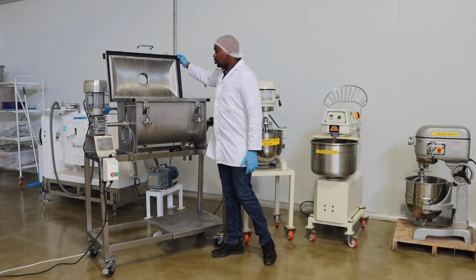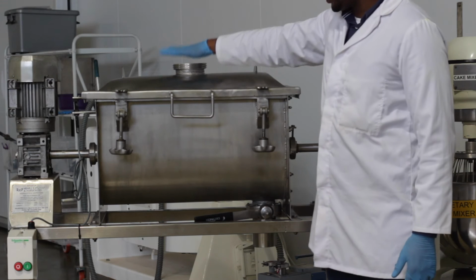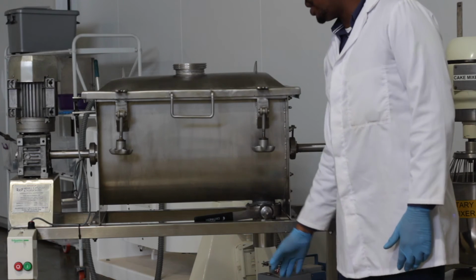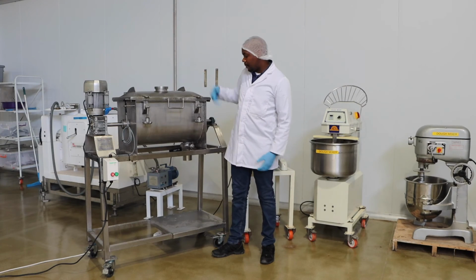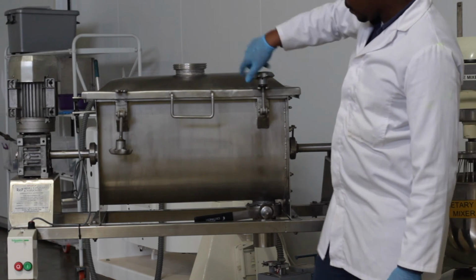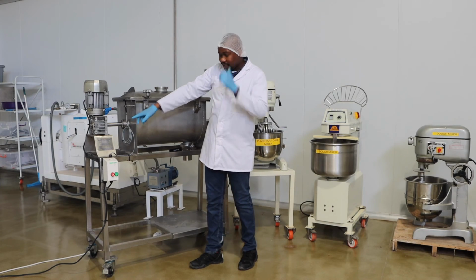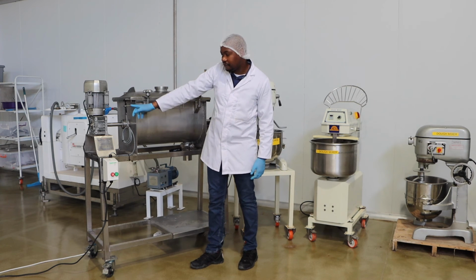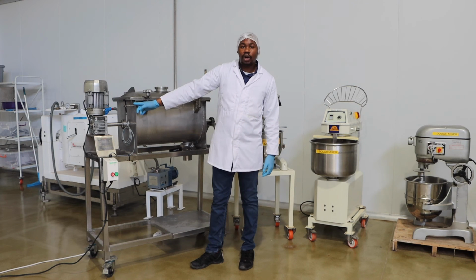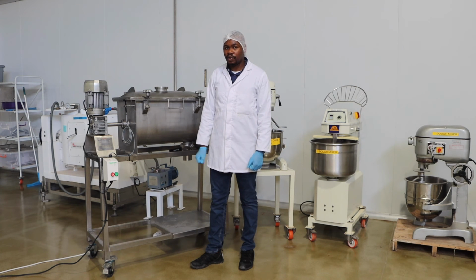The nice thing about this equipment is that it can open and close. So the product can come in here, or you can pre-fill it, and then here there is a valve that you can open when the product is done. So what basically happens is that you would close your mixer here. What I would like to point out is that this mixer has a safety valve. So if this is open, even if you can start it here, it will not move because of this safety mechanism that is put in place.